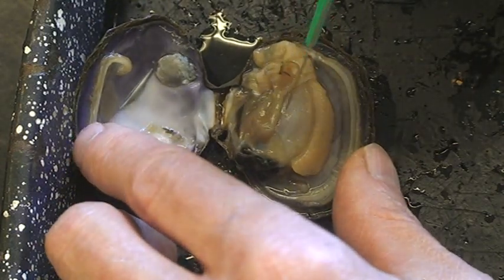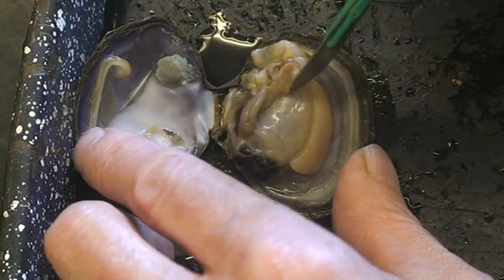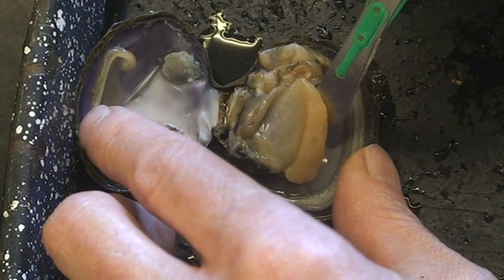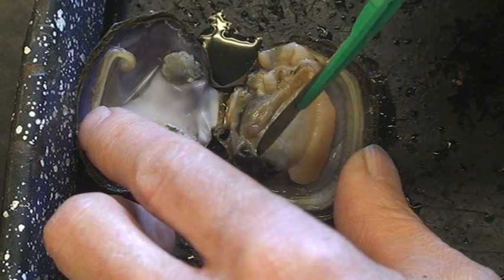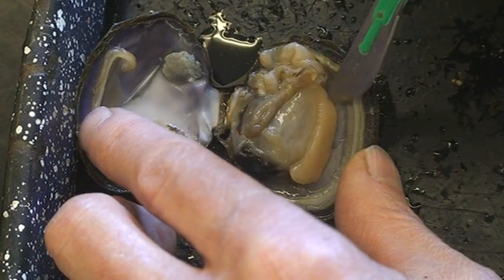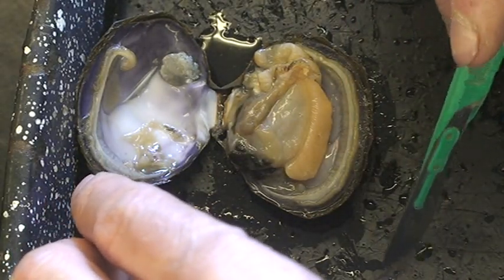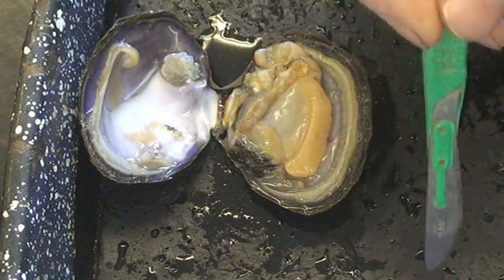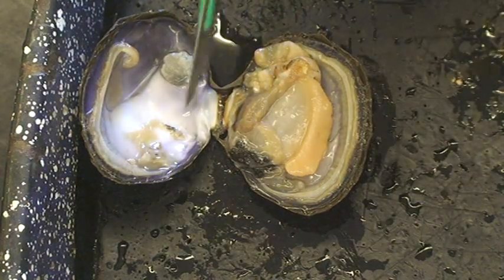One of the most prominent things when you open the shell is this big piece right here — that's their foot. Their foot is on the anterior side, so their foot is up by their head. In fact, their mouth is right there. They stick this out — they open up the shell and stick this out down into the substrate, pump blood down there and make it thick so they can pull themselves down into the substrate. That's how they move around, or they can push it out to rock the shell and so forth.